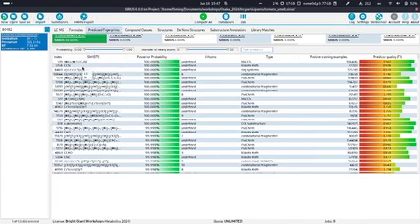Just to explain this a little bit, you have the index of your substructure, you have the SMARTS, you have the posterior probability, which just means: do we think that this property is present given the data we have measured. Then the number of atoms, which we don't have for all the substructures, where we will have just undefined, then the type, and the positive training examples.